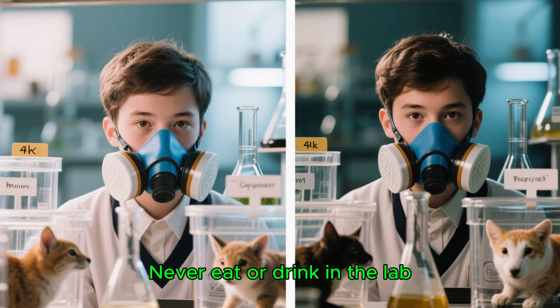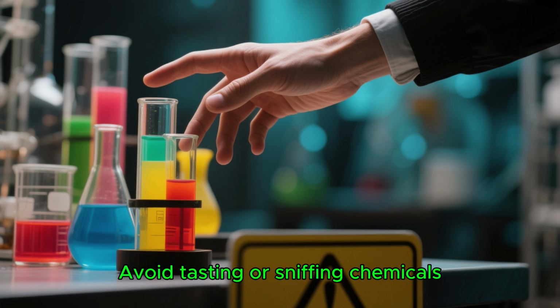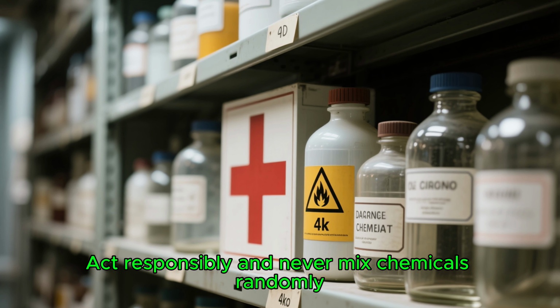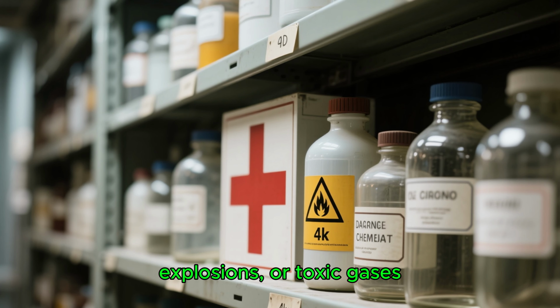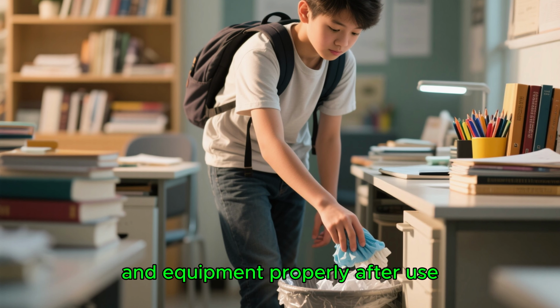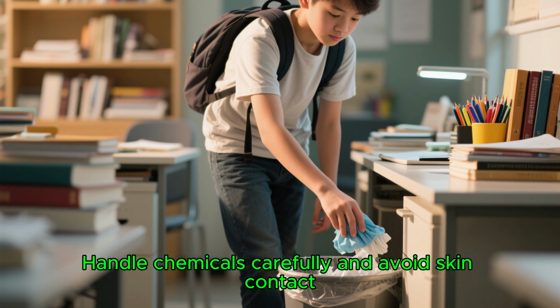Never eat or drink in the lab. Do not store food with chemicals or experiments. Avoid tasting or sniffing chemicals as this can be dangerous. Always label containers to know what's inside. Act responsibly and never mix chemicals randomly as this can cause fires, explosions, or toxic gases. Keep the lab clean. Store glassware, chemicals, and equipment properly after use. Dispose of waste correctly. Handle chemicals carefully and avoid skin contact.